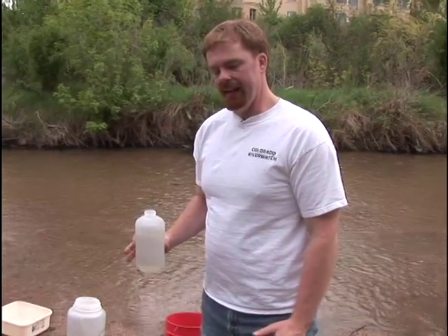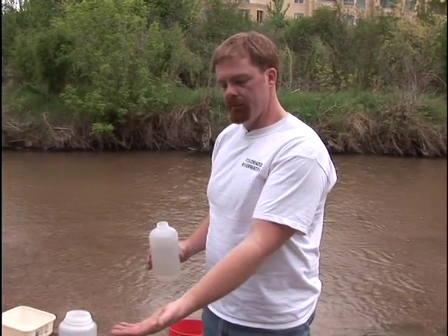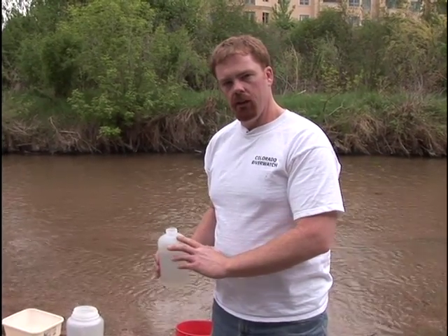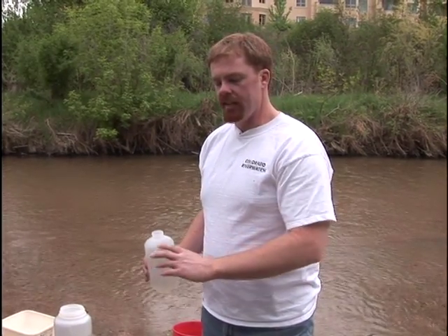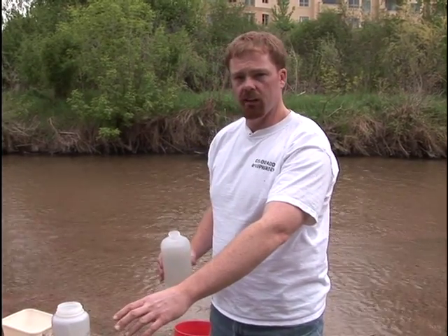Later that night, after you've collected the sample, you will need to decant the alcohol that's in the sample. Decanting is removing approximately half of the alcohol that's in the sample and then adding fresh alcohol. When you decant the alcohol that's currently in the bottle, you remove the excess water that's been collected with your sample and replace that with fresh alcohol. Fresher alcohol will mean the bugs will be preserved longer.